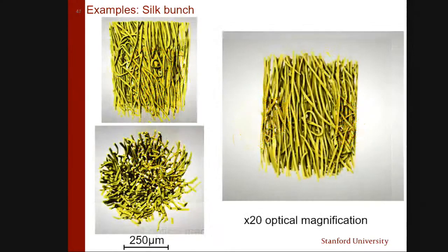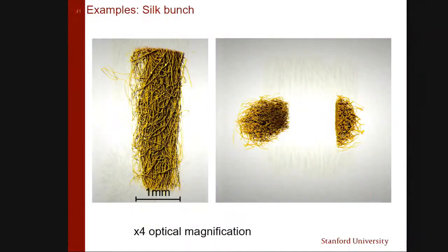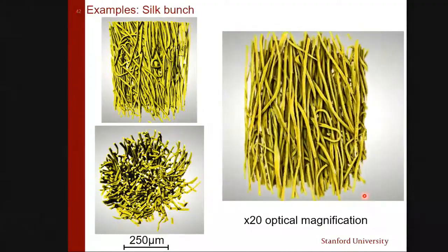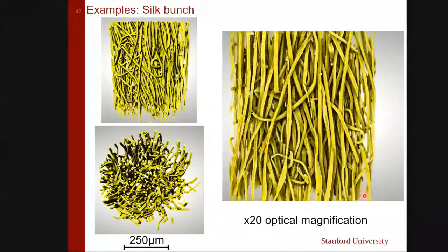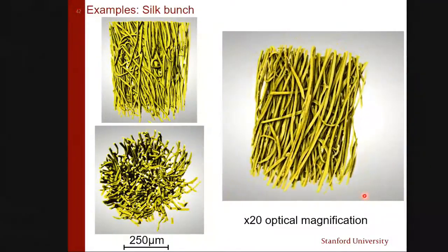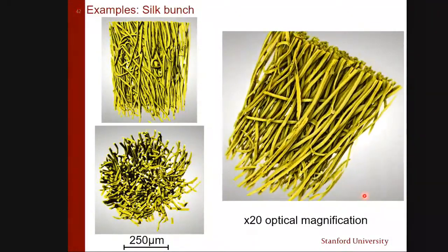If I do higher magnification, then I'm actually now measuring not the whole bunch, which I saw here, but only inside a small part of the bunch, but with higher resolution. Now, this is 20x optical magnification. And again, I can do this kind of rendering and movies and stuff like that. So this is very interesting.